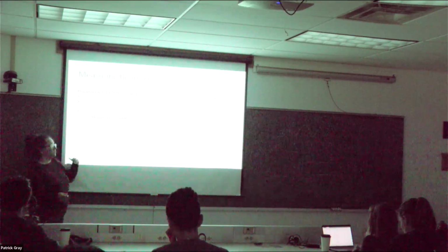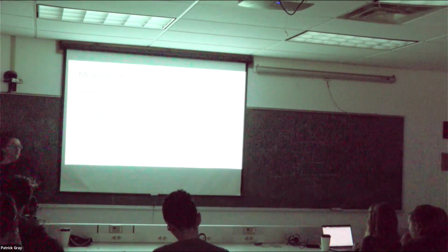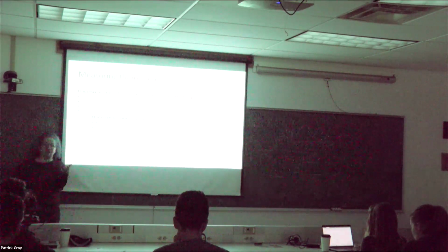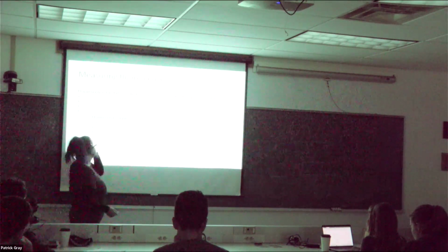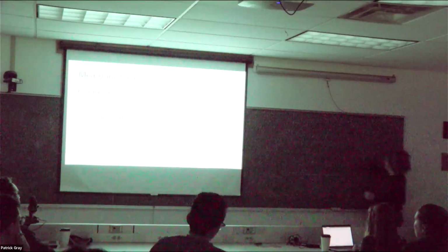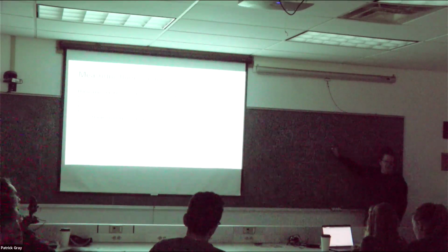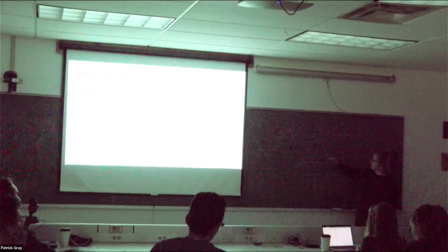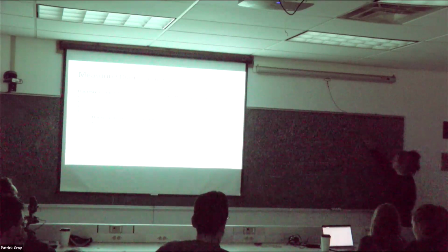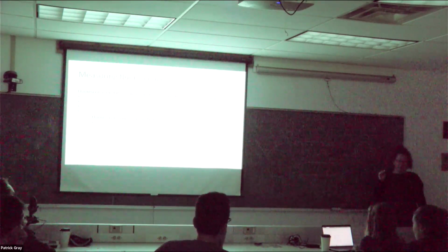A cheesy example of the fluorescent emission spectrum is pretty much if you look at remote sensing reflectance, or the data from backscattering this morning. That's a cheesy version of the fluorescent emission spectrum, because you can see the whole spectral response of the fluorescence. You're not shooting it with only one wavelength, you're shooting it with all the light. But in theory, if you were shooting the light at 440 and detecting backscattering across the whole spectrum, you would be able to see the whole fluorescent peak spectrum. The bump that you saw in the end.